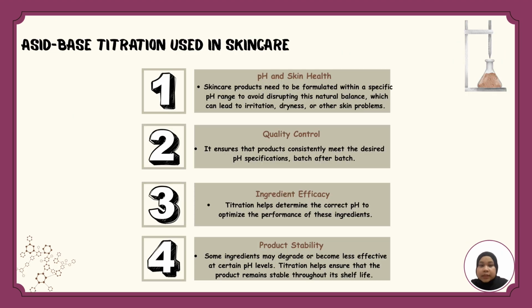Okay, acid-base titration used in skincare. Acid-base titration is used in skincare formulation primarily to accurately determine and control the pH of products. This is crucial because pH affects skin health, product stability, and ingredient efficacy. By using titration, formulators can ensure that skincare products are within the desired pH range, preventing irritation and maximizing the effectiveness of active ingredients.